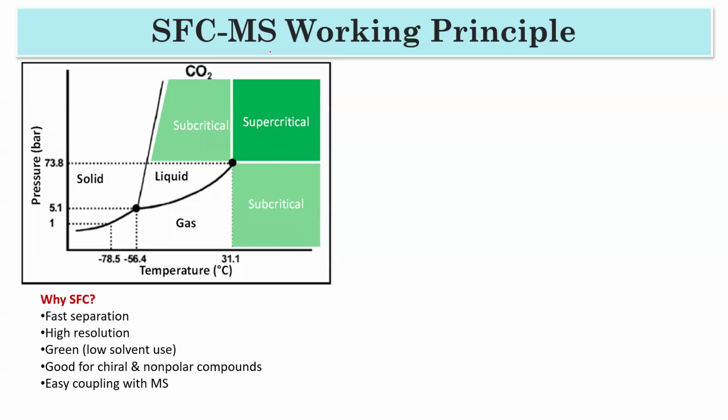In simple LCMS and GCMS, we are using some kind of gas or liquid as the mobile phase. But in SFC-MS, you can use CO2.